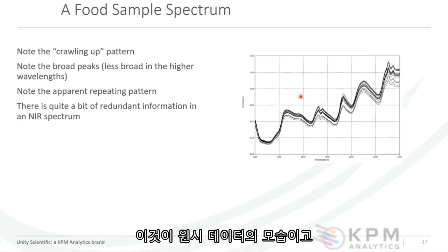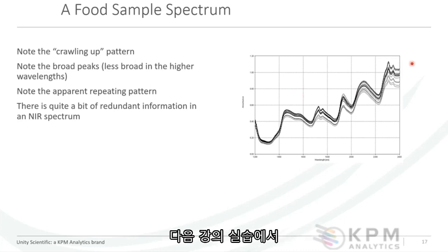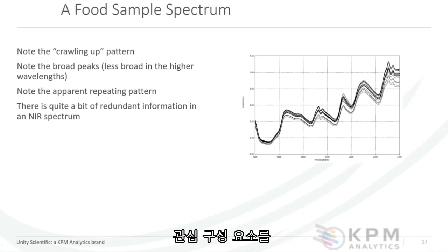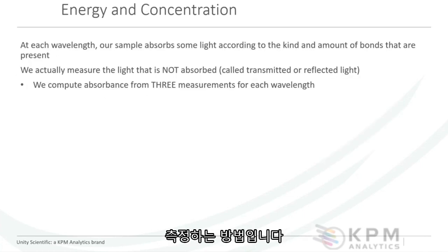So this is what the raw data looks like. And this is what we will be spending the next lectures and exercises on, how to collect and utilize this raw data to measure our constituents of interest.